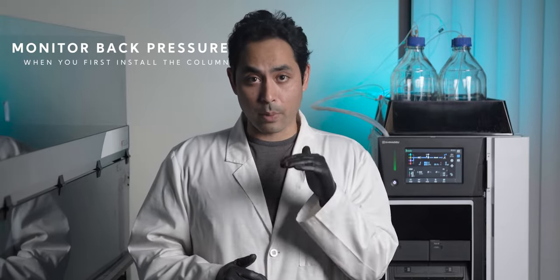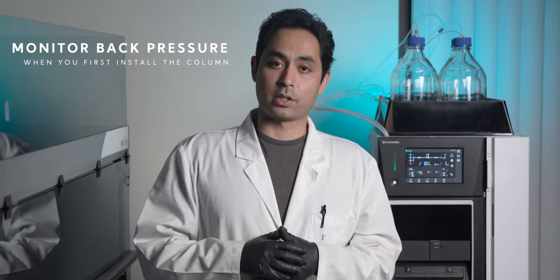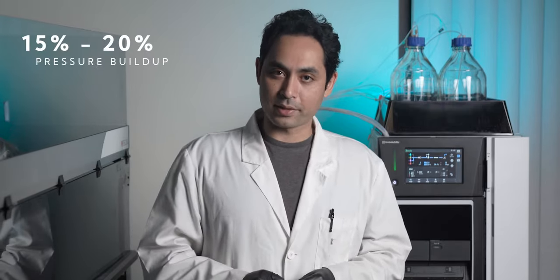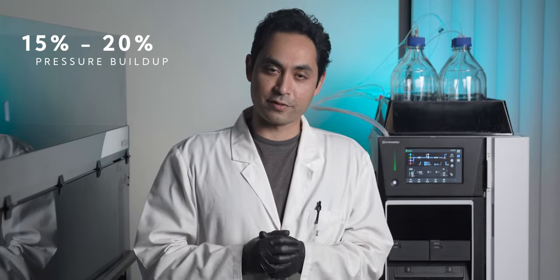The way that you know it's time to do a deeper cleaning is to monitor your pressure buildup on your column. Always note the back pressure when you first install the column so you have a baseline. If you notice your pressure kick up around 15 to 20% it's a good idea to do the reverse flush.